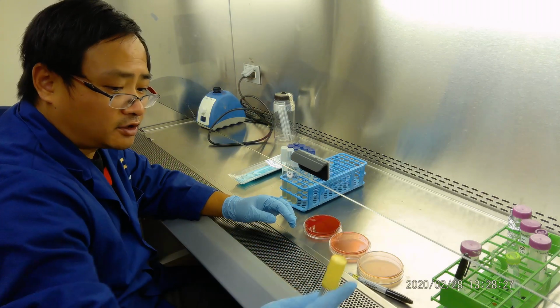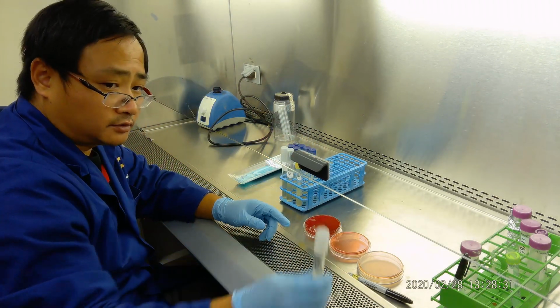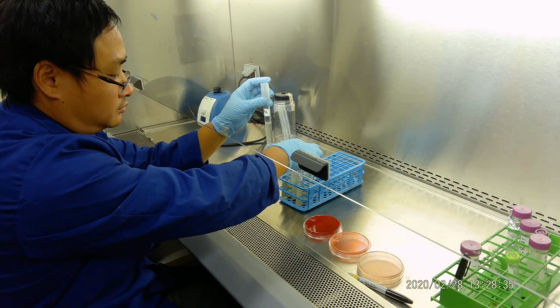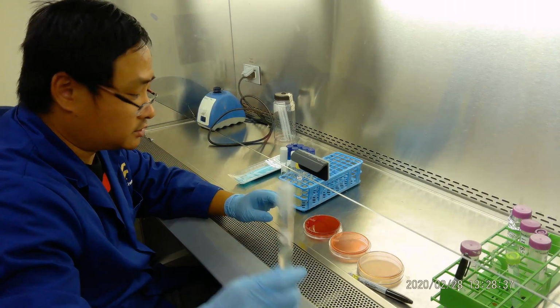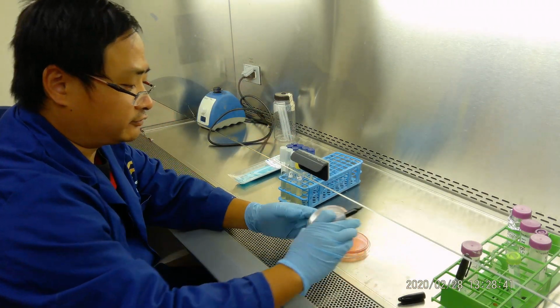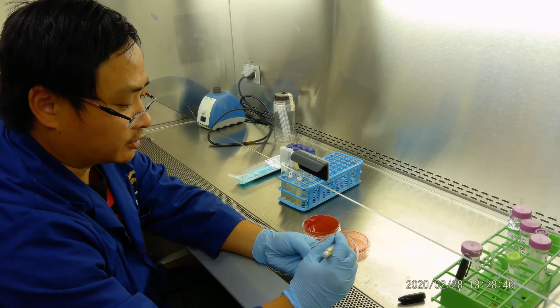So we have Staphylococcus aureus, we have E. coli, and we have Pseudomonas. Pseudomonas is right here. So okay, what are we going to do? The first job is we have to label. So Lee, take a picture right here. We have to do a label.